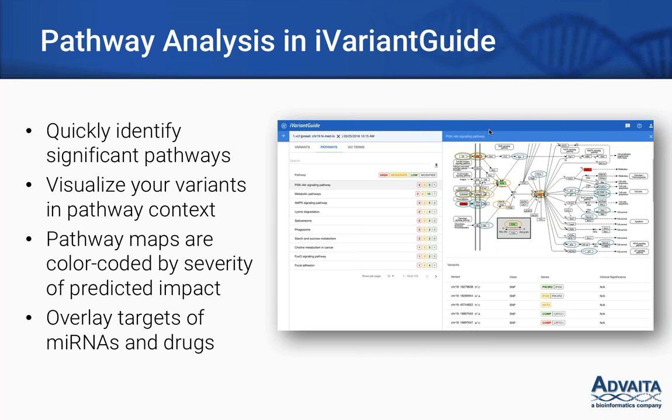There are a number of ways this can be used for hypothesis generation, and the important point is that with this analysis you can generate testable predictions about your subjects.